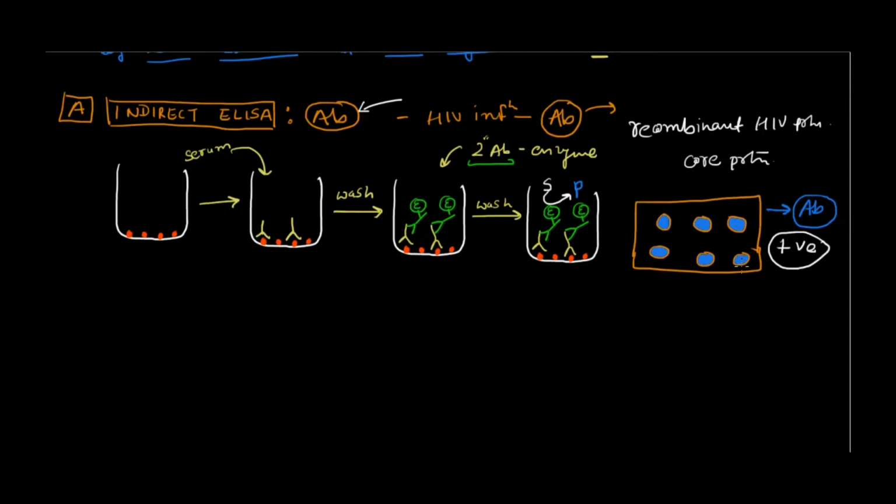Right? Now, this was about the detection. It just gave me simply positive or negative result. I can also measure the quantity, because generally when we take a sample, we don't take directly the sample and add. We generally dilute the sample, and then we perform this test for those diluted samples.